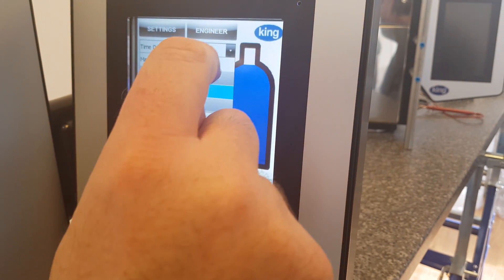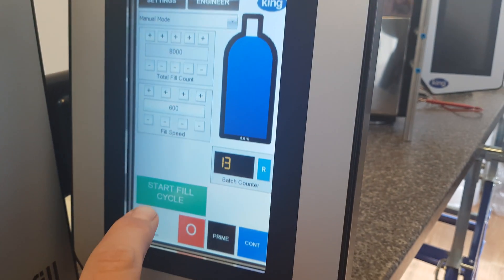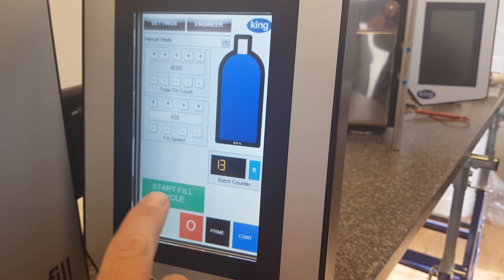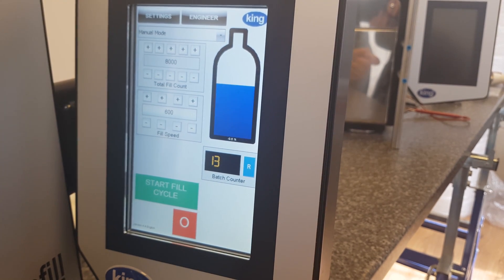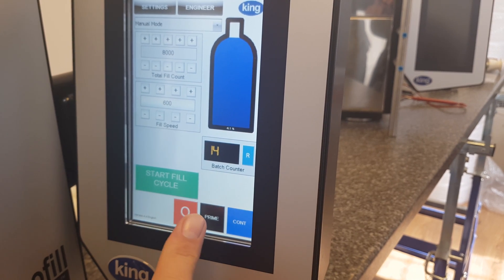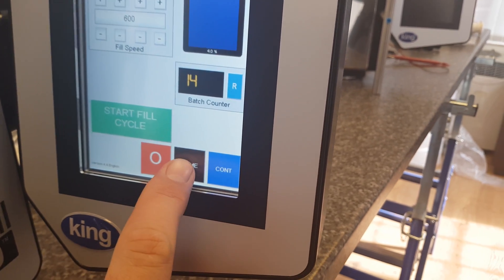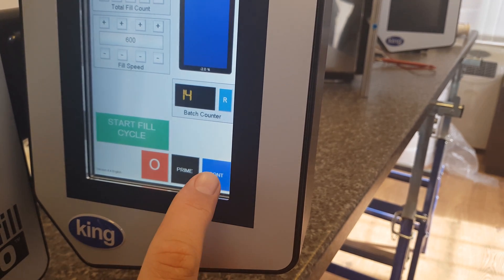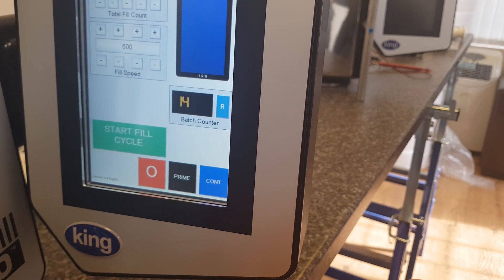To stop the cycle, press stop cycle. If we're in manual mode, you see the time delay box disappears, because this will only do one cycle and then stop. Here we have a prime button, which when pressed and held runs the pump. And then we have a continuous button, which runs the pump until you press it again to stop.